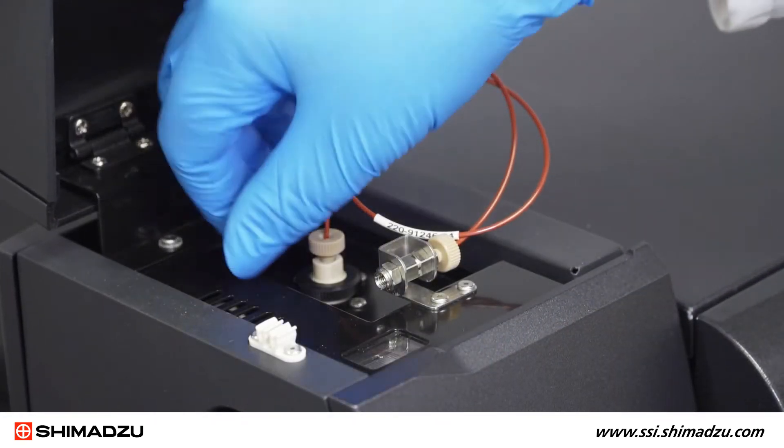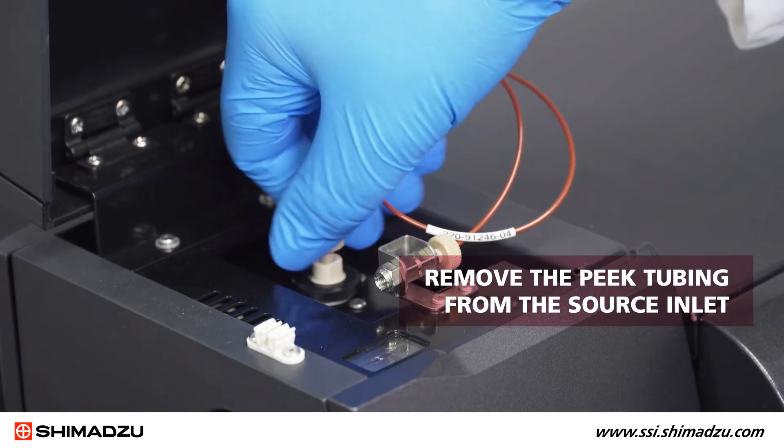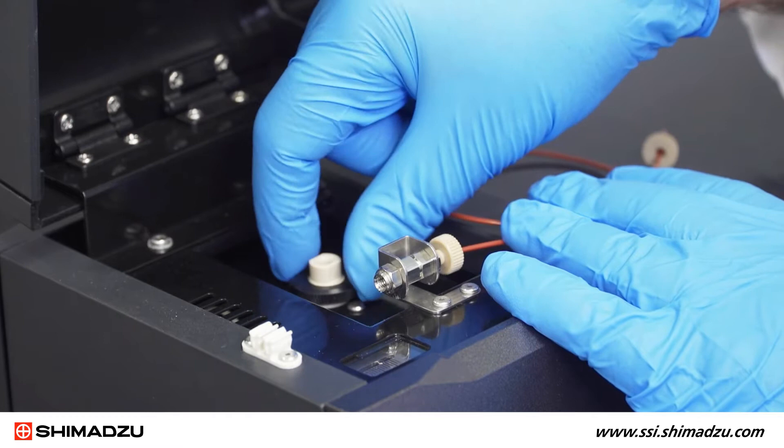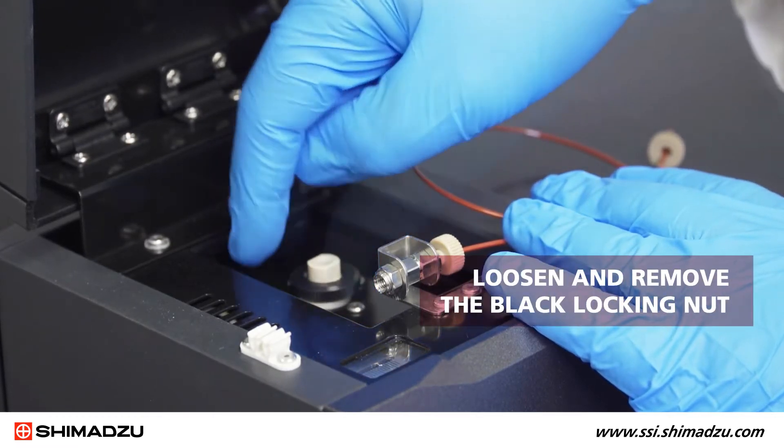First, open the ESI probe cover and remove the peak tubing from the source inlet. Once the tubing has been removed, you will need to loosen and remove the black locking nut.